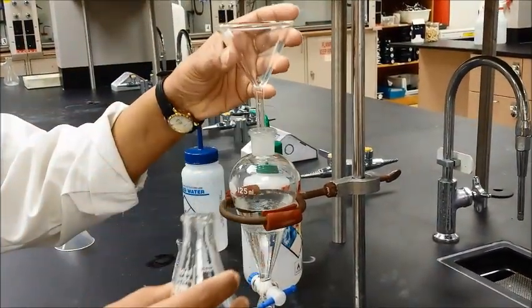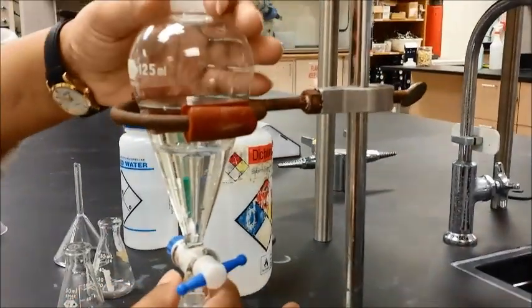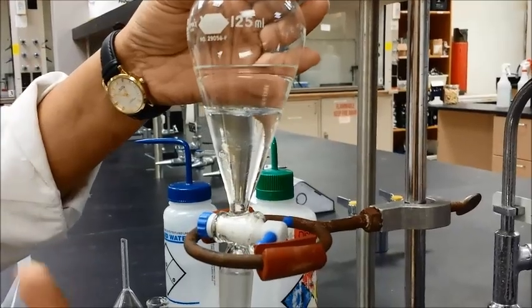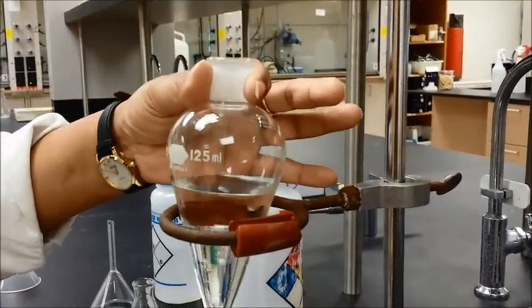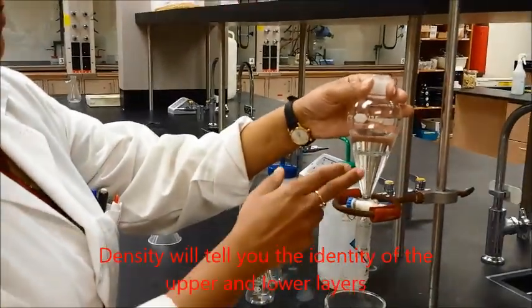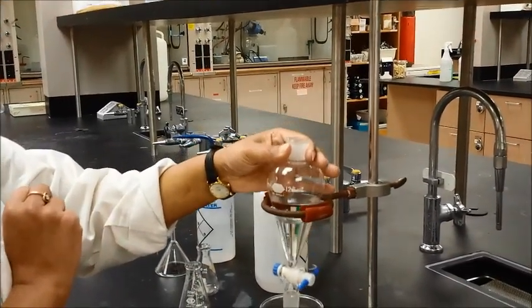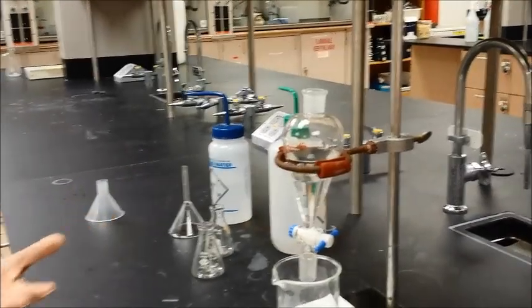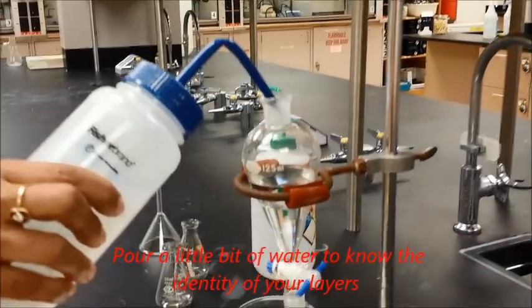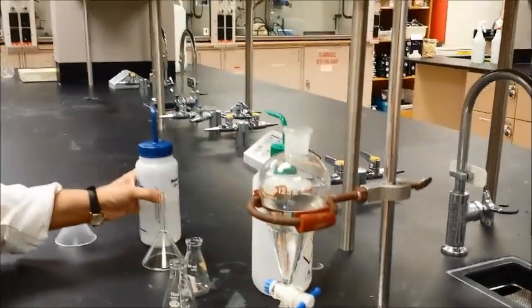The separatory funnel is used to separate two liquids which are immiscible with each other, so you will see two layers in there. You have to determine which is the aqueous layer and which is the organic layer. If you know the densities, for example dichloromethane is heavier than water, so the bottom layer is the organic layer and the water layer is above. If you're not sure, pour a little bit of water into the separatory funnel and see where it goes — in this case, the water stays on top, which means the top layer is the aqueous layer.